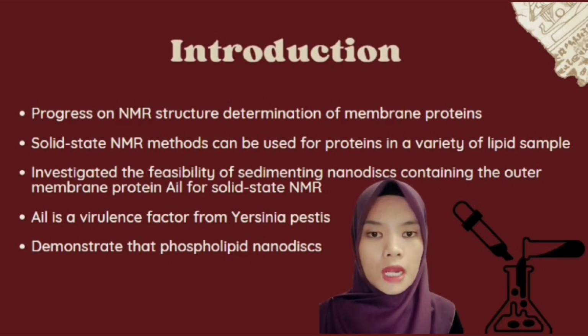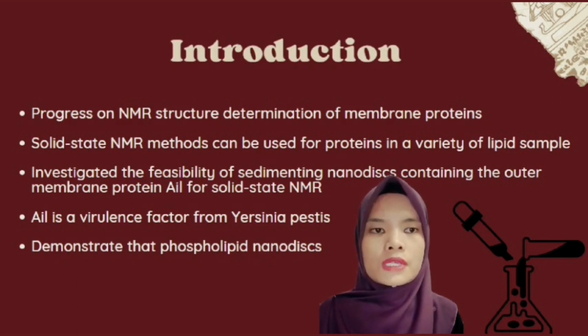Precipitation using polyethylene glycol or lyophilization were previously employed to pack samples in the constrained volume of a MAS rotor. High-resolution NMR spectroscopy requires a high detergent concentration, which is incompatible with the ligand-binding activity of Ail. NMR investigations of structure and activity are then no longer possible. Protein contained in a lipid bilayer nanodisc is completely functional and produces good resolution. The same samples can be used for concurrent activity and NMR experiments.